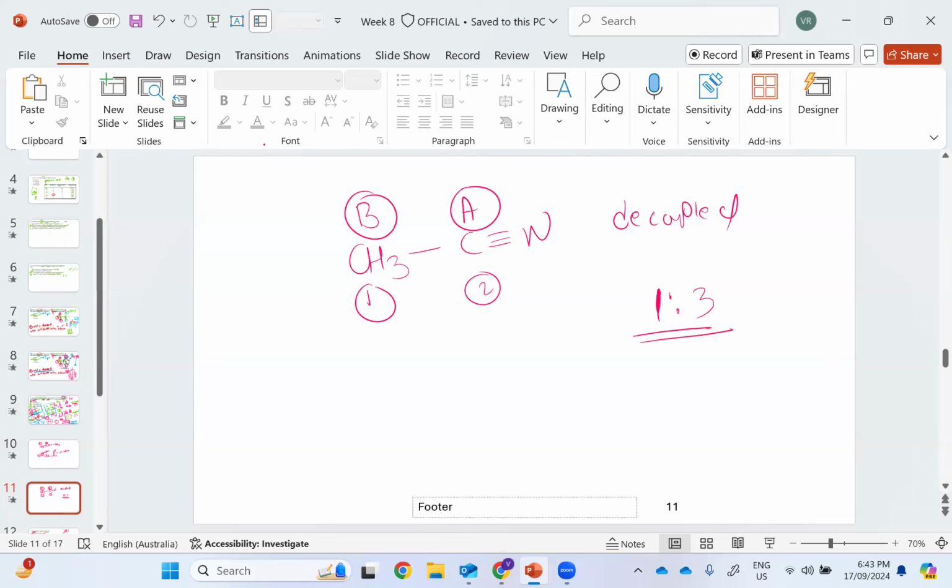And again, in the coupled one, this will show, if we are considering the 2J-CH coupling, and generally it is observed, as we see in the proton, this will also be observed in the carbon NMR spectra.